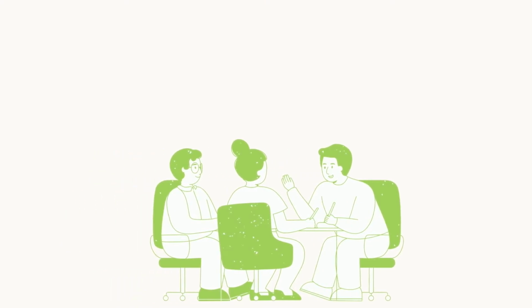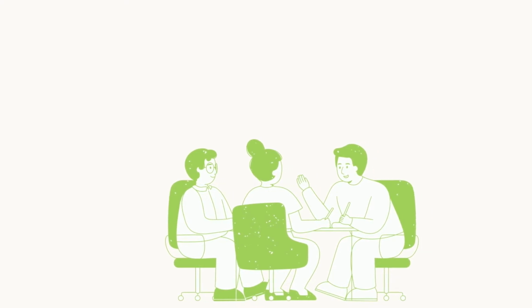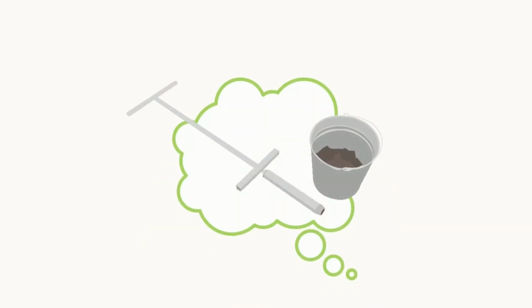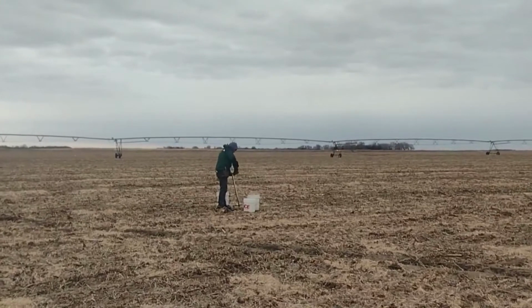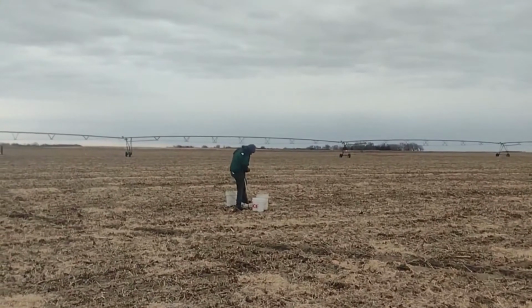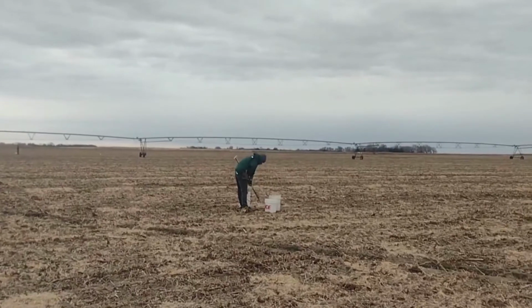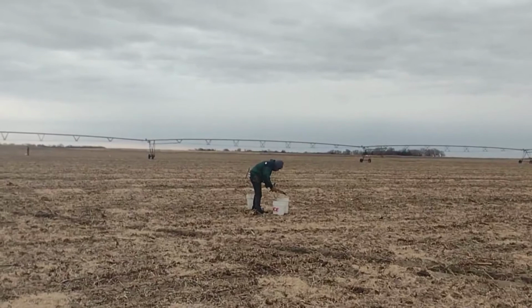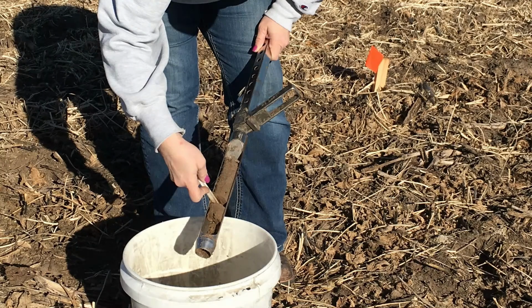And so over time, there's been a lot of work that's gone into how to standardize soil sampling. And they've developed these sort of sampling probes, different sizes that maintain a volume. Every time you take a sample with this tool, this probe, because the tube size is always the same, you go to the same depth, then you have a cylinder of the same volume in different places throughout the field, and you get a number of probes full of soil.